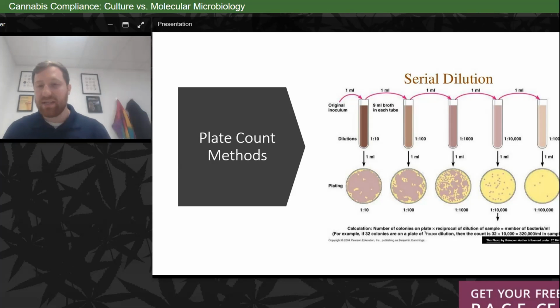As you can see here, this is just a diagram of 1 to 10 dilutions going through. You can see that 1 to 10 is TNTC, or too numerous to count. The 1 to 100, we're seeing about 10x less. And as we move down, every plate should have at least 2, so that we can get a good feeling of where we are with these dilutions, and ultimately if there's any sort of matrix interference that could be occurring.